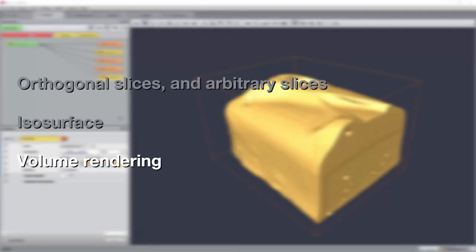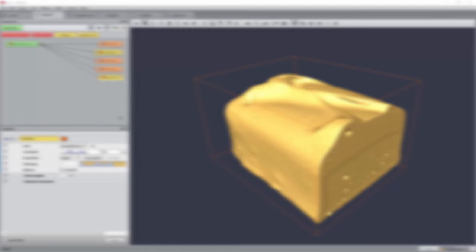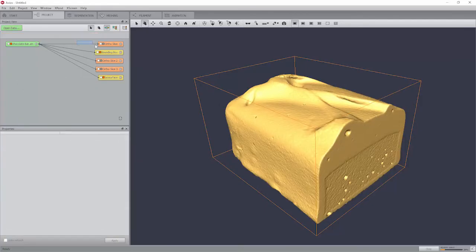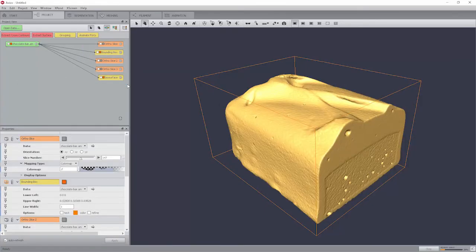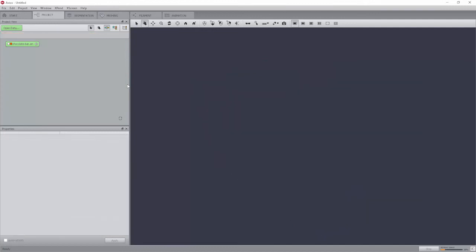Volume rendering. Remove all objects in the project view other than the chocolatebar.am data record. Volume rendering is a visualization technique that gives a 3D impression of the whole dataset without segmentation. The underlying model is based on the emission and absorption of light that pertains to every voxel of the view volume.